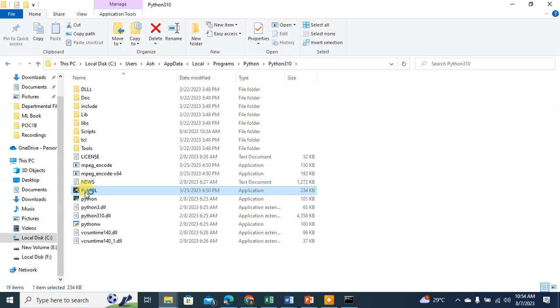It will start your open source Pymol program, and you can enjoy working with Pymol. I hope now you will be able to install your open source Pymol software. It is free for academic users.